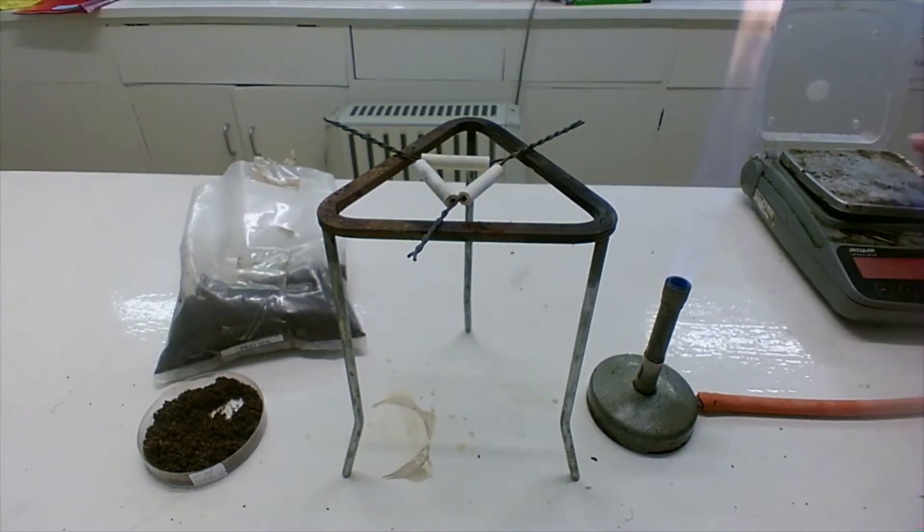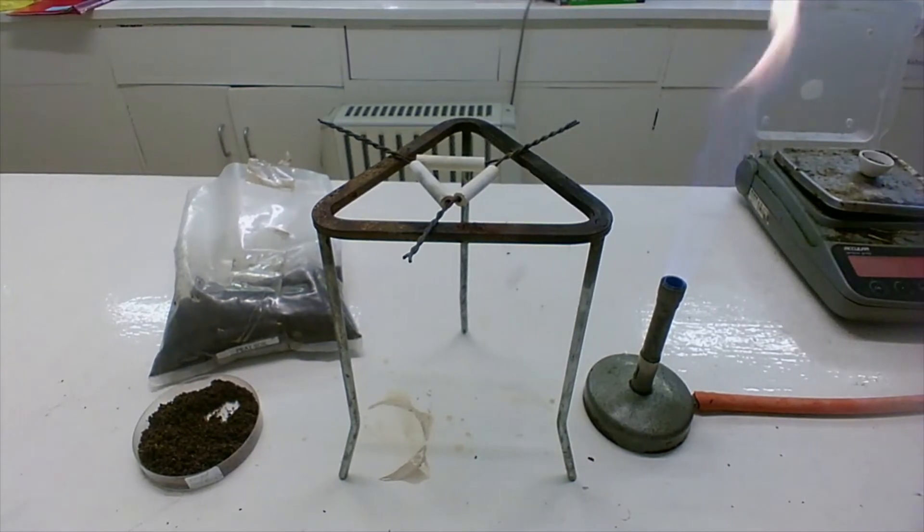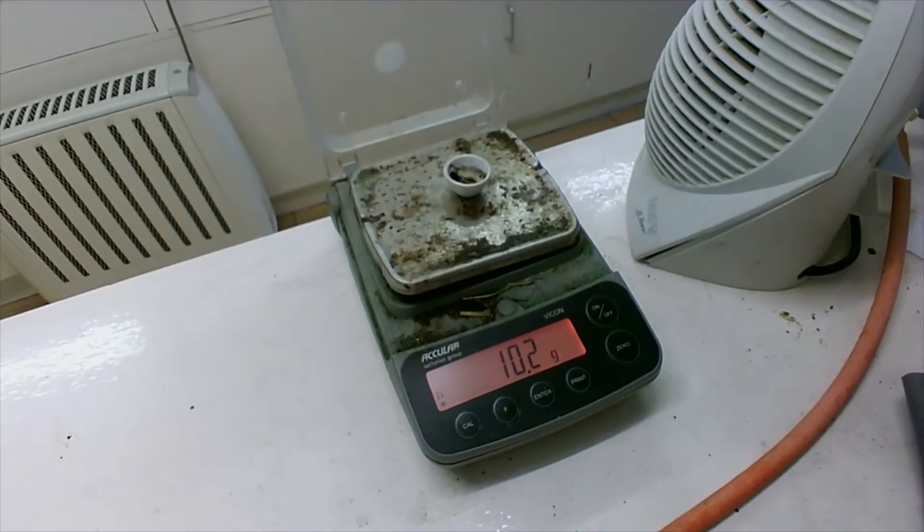The first thing I do is I just get the mass of the crucible on its own, note it down into your table — 10.1 — then add in a bit of the soil sample.